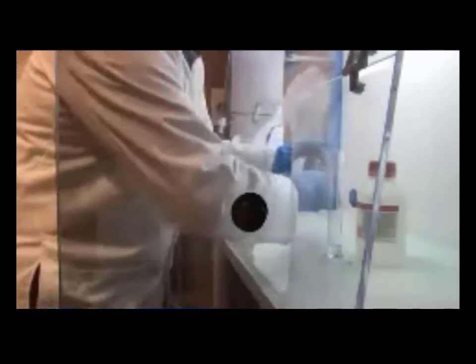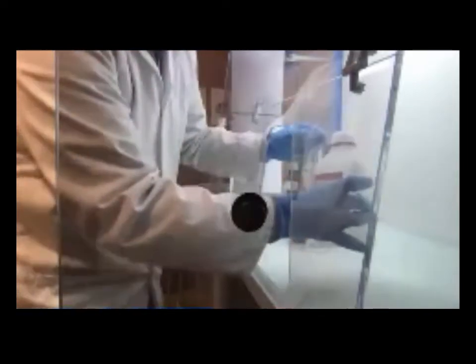Ether is the one you really have to tighten the top of because it's a very pernicious solvent. Okay, that'll do. It's a little bit shy on the meniscus. Okay, so that's our solvent. So we have our solvent.